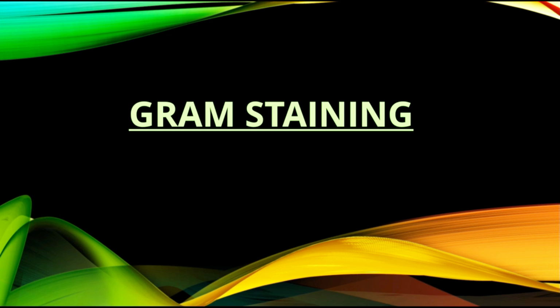Today I'm going to discuss gram staining. Particularly, I will be talking about the procedure of gram staining, how gram stain is performed in a microbiology lab. Today I'm going to discuss it. So let's start gram staining.